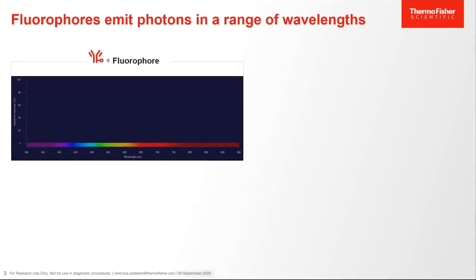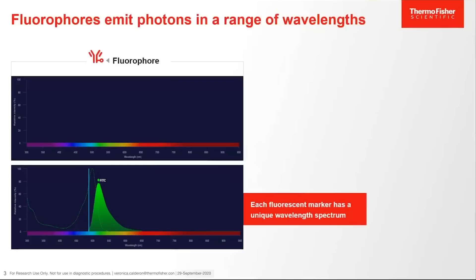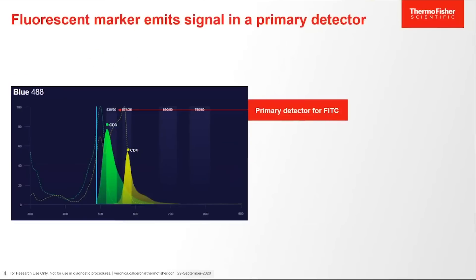Fluorophores emit photons in a range of wavelengths. Each fluorescent marker has a unique wavelength spectrum, as shown here with the FITC fluorescent marker. The spectra of the fluorescent marker determines the primary detector from where it will emit. For the CD3 FITC antibody, it is excited by the 488-nanometer laser and is collected by the 530-30 bandpass, as shown. Issues can arise with the tail end of the wavelength, which can overlap into a secondary detector, as shown with the CD4 PE antibody.